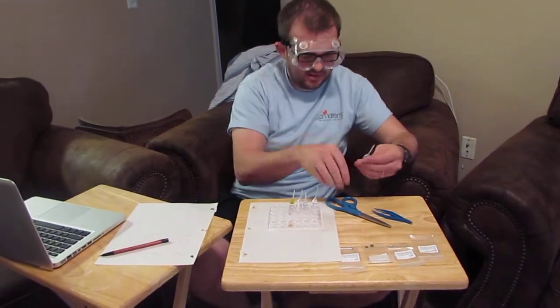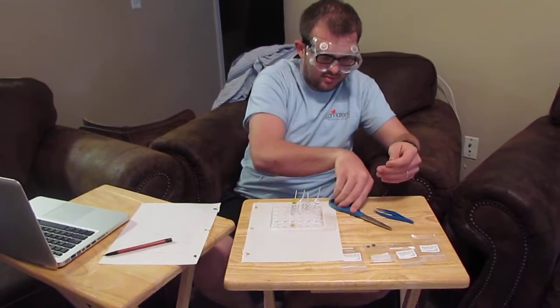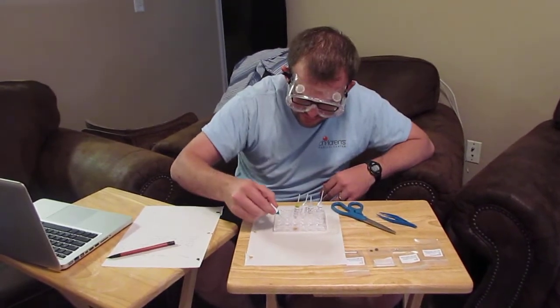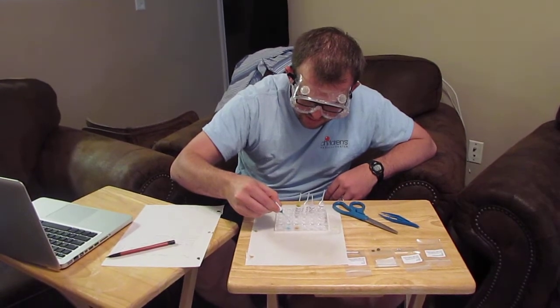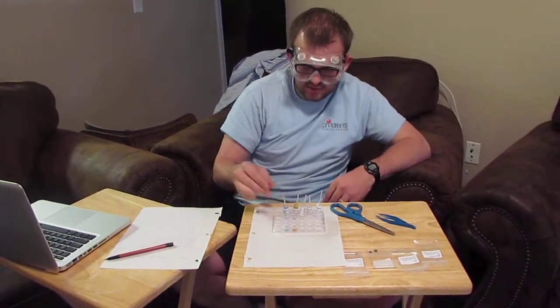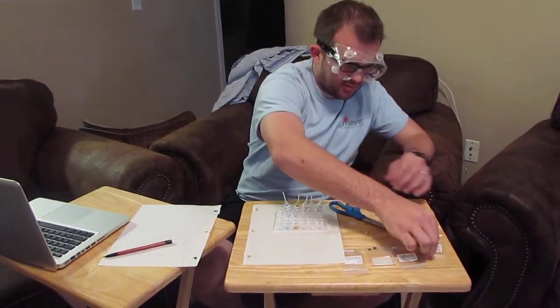And last, copper 2 sulfate in A5. 4, 5, 6, 7, 8, 9, and 10. So there's my chemicals. Make sure they all got good on the bottom.